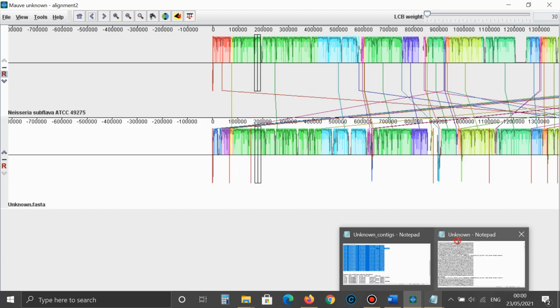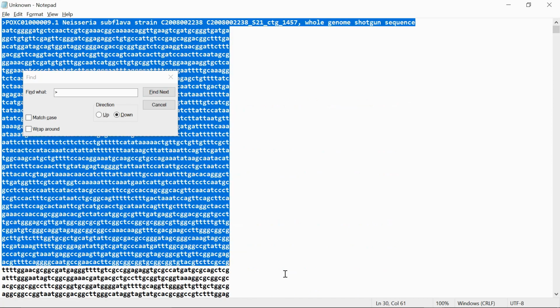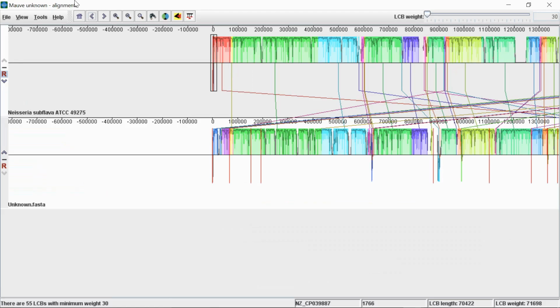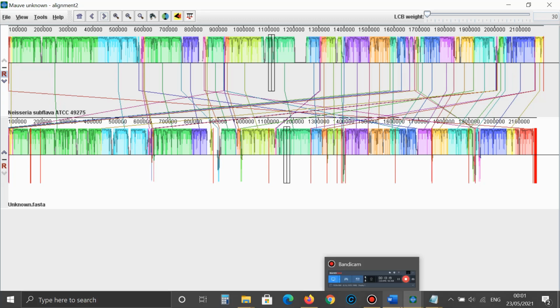So you do have a FASTA file, but there's one problem with this. It's not a consensus sequence. So you could almost butcher together a single genome file by deleting these. But I think the point is, I've had this before, where when something was arranged in lots of nodes, it was quite often that the breaks in the sequencing, so the node boundaries or the contig boundaries, happened at specific points, and every time you got one, there was a bit of information that was missing. So we actually went back and we used a much longer read sequencing technology just to sequence over these gaps. So there you go. That's pretty much it.